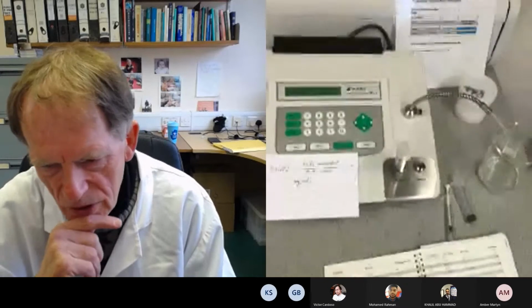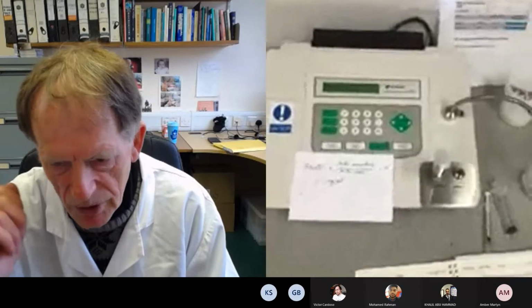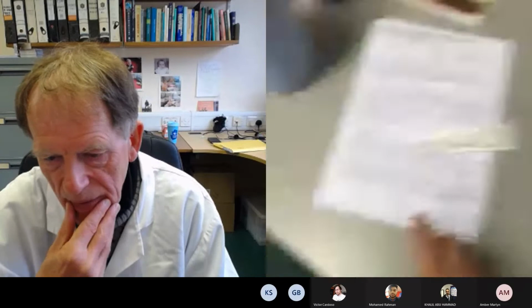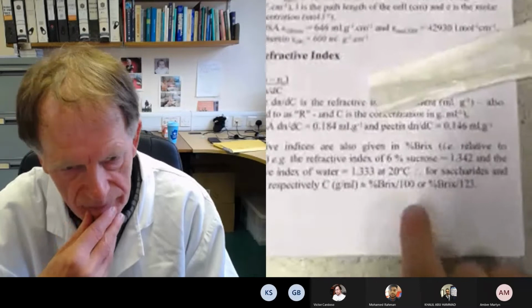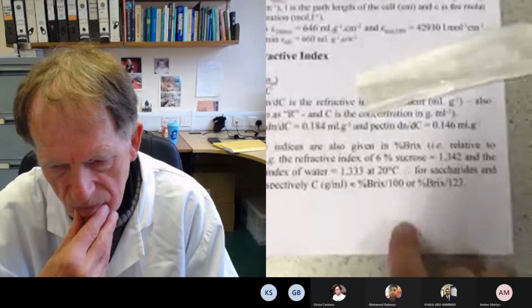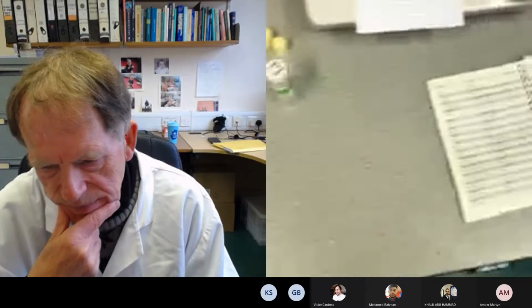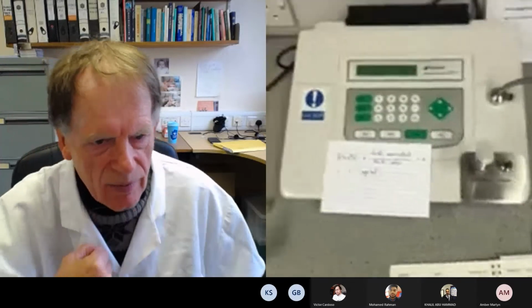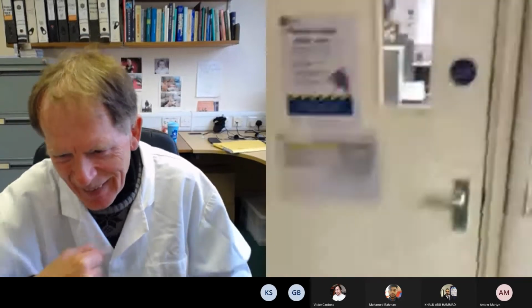Yeah, okay, that's fine. It's not too far away from the value we got for the spectrophotometer, and then of course we multiplied by 11. And of course, we haven't done this, Steve, because if we divide 0.19 by 0.15, that would bring it down a little bit more, I think, closer to that of the spectrophotometer. Okay, that's fine, Vlad. Yeah, it should be about the same. Okay, thanks, Vlad, for that, and incredible work using one hand with the camera. Back to you now, Steve.